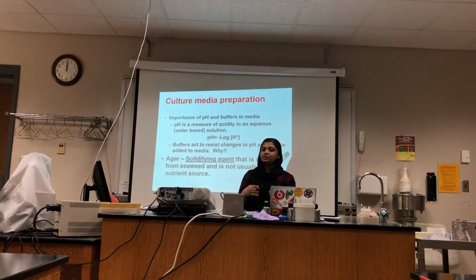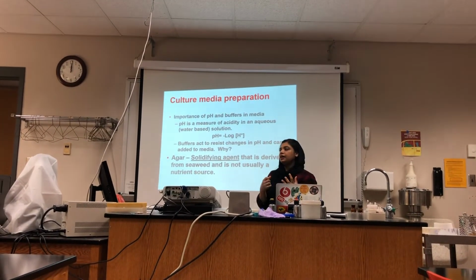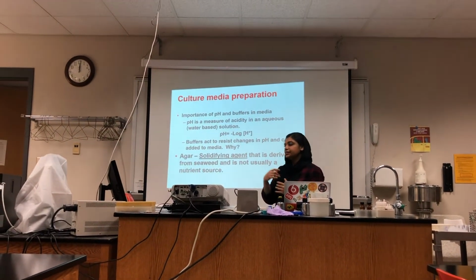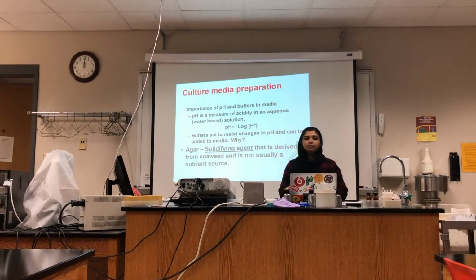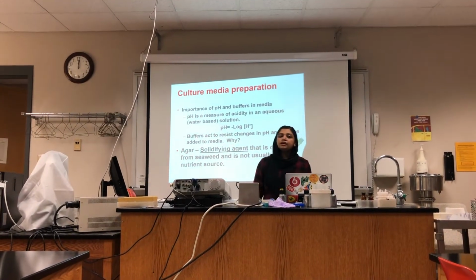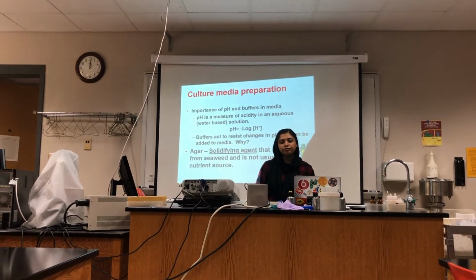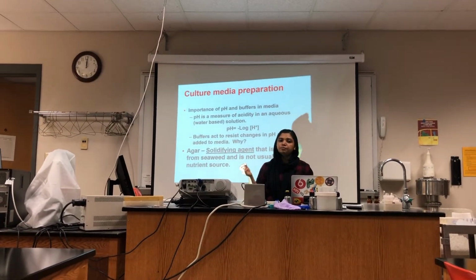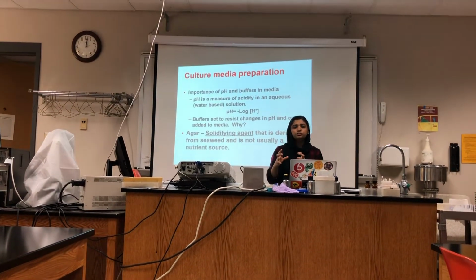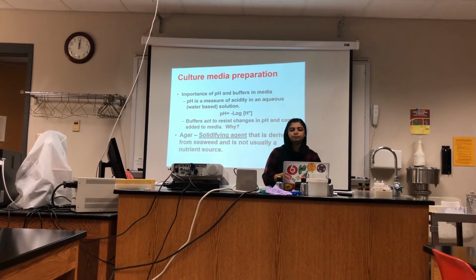The pH, I think you guys are familiar with what pH is. pH is the measure of acidity of a solution, and there's an equation for that: pH is equal to the negative log of the hydrogen ion concentration in that solution. And we are using an agent called agar. Agar is a solidifying agent derived from seaweed, and it is actually not a nutrient source, but just a medium to grow the microbes.